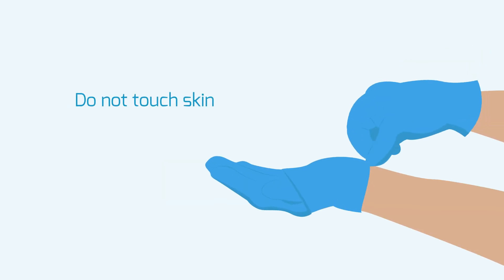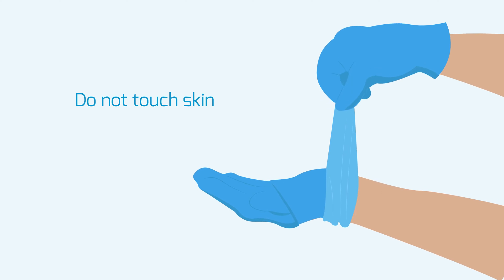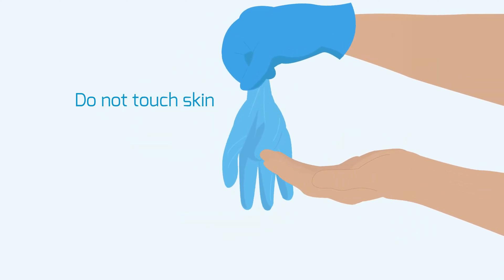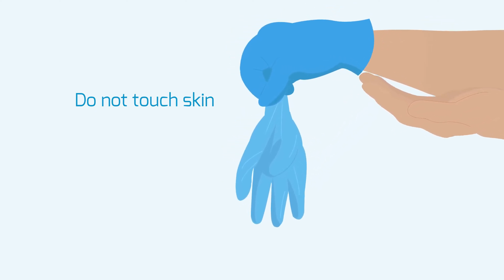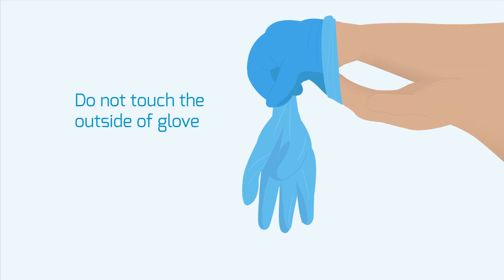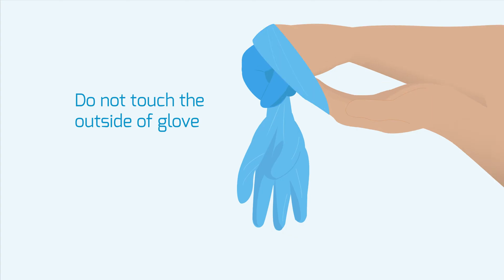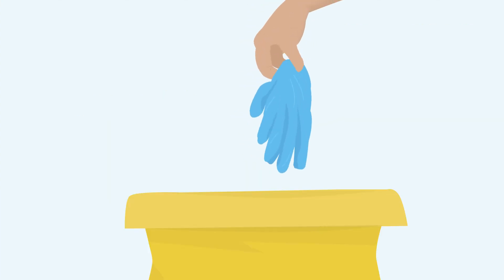Remove gloves first. Pinch one glove at the wrist without touching the skin on the forearm and peel away from the hand, turning the glove inside out. Hold the removed glove in the gloved hand. Hook the index and middle finger of the bare hand inside the remaining glove, taking care not to touch the outside of the glove. Pull off the glove, turning it inside out with the first glove inside. Dispose in bag provided.